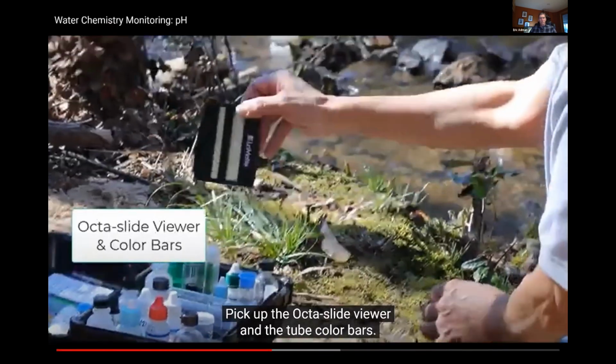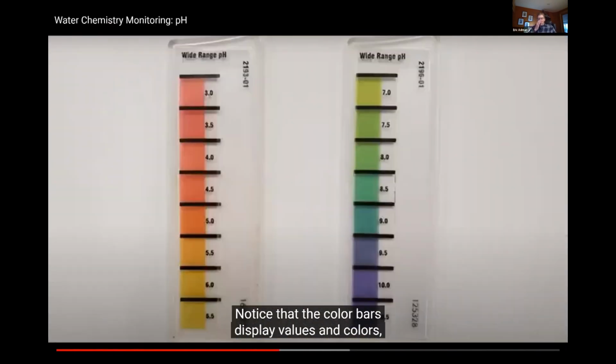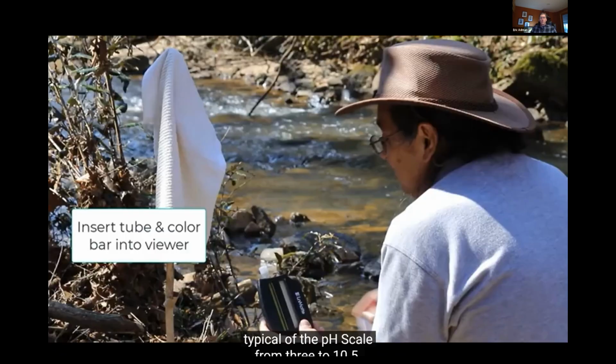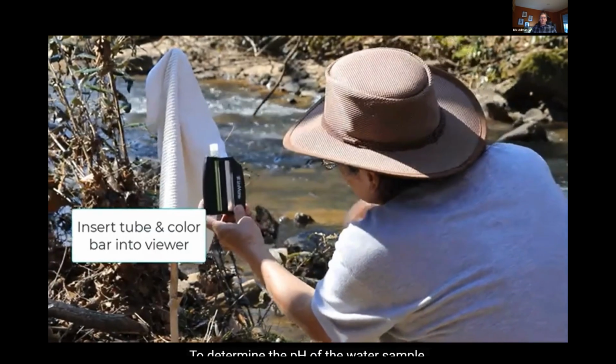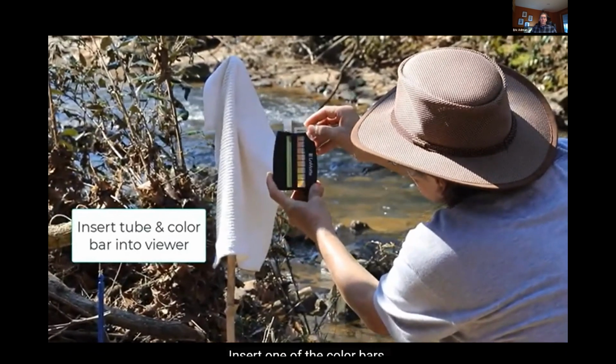Pick up the OctaSlide viewer and the 2 color bars. Notice that the color bars display values and colors typical of the pH scale from 3 to 10.5. To determine the pH of the water sample, insert the tube into the OctaSlide viewer. Insert one of the color bars.